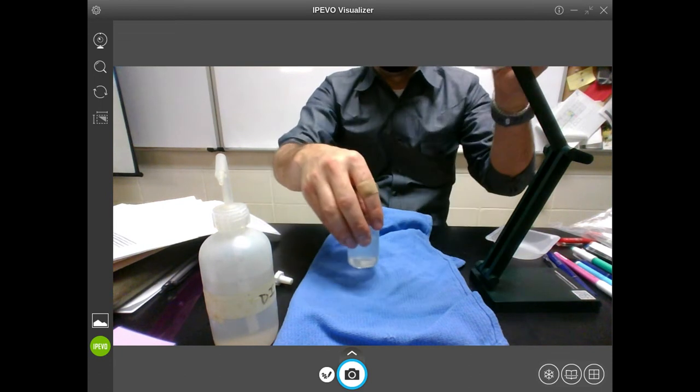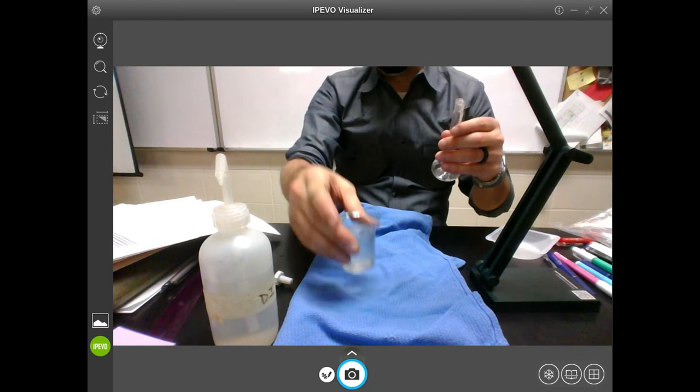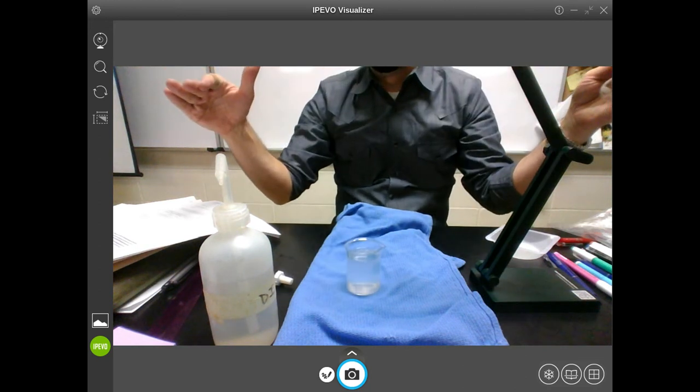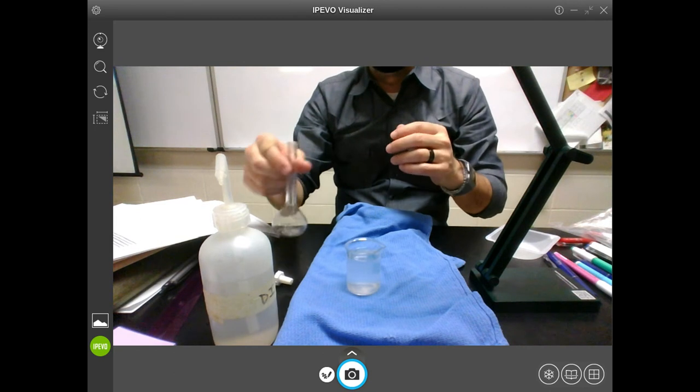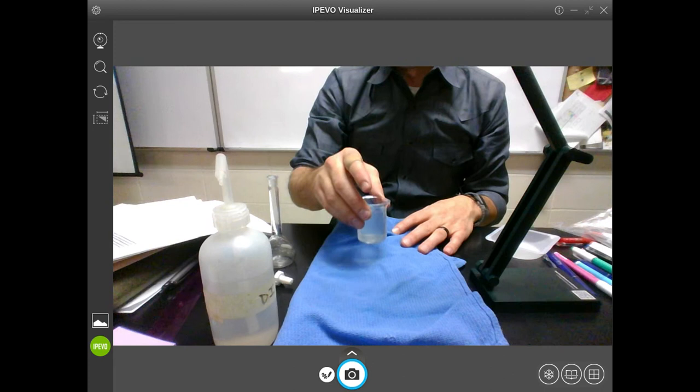You know that this, even if you don't get it all out, remember it's all mixed up, right? So whatever the concentration is here is the same as whatever's left in here. It's fine. It's the same concentration because you've got it all mixed. Does that make sense? Okay. Any questions about that?